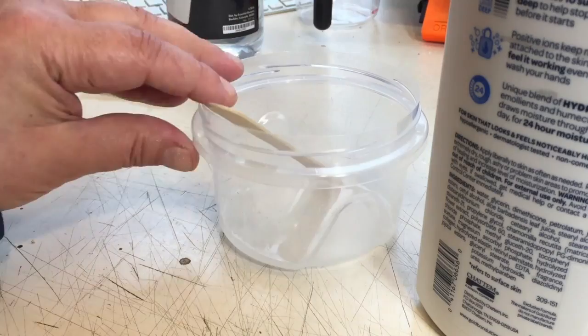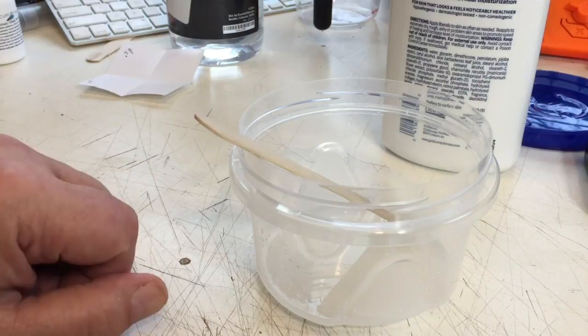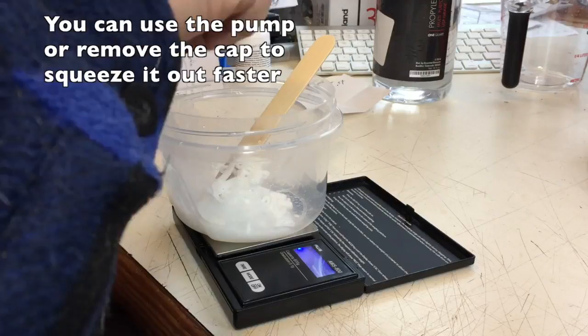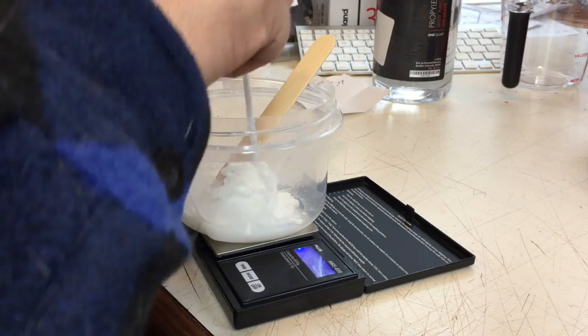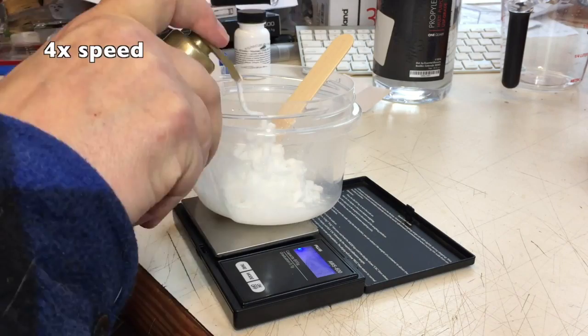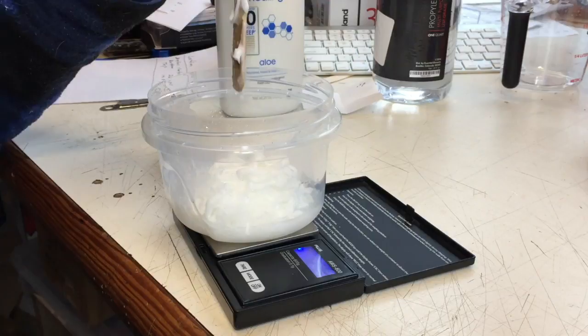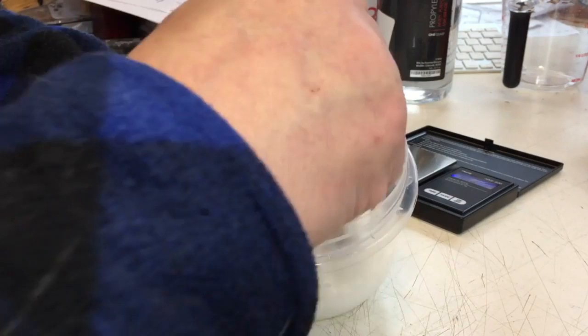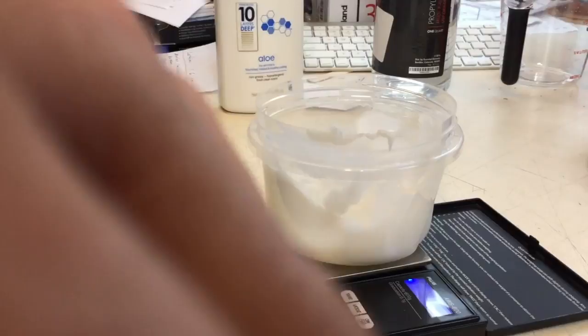Right now this is about four percent ivermectin, but if I top this up to 100 grams it will become one percent ivermectin. What I want to hit is 126 grams total — that'll be 100 grams of lotion plus the 26 grams from the container. I'm at 93 grams now. I can watch the scale exactly. Okay, 127 — if I take out the stick it goes back to about 122. So right now what's in this container is going to be one percent ivermectin, and it has mixed beautifully.